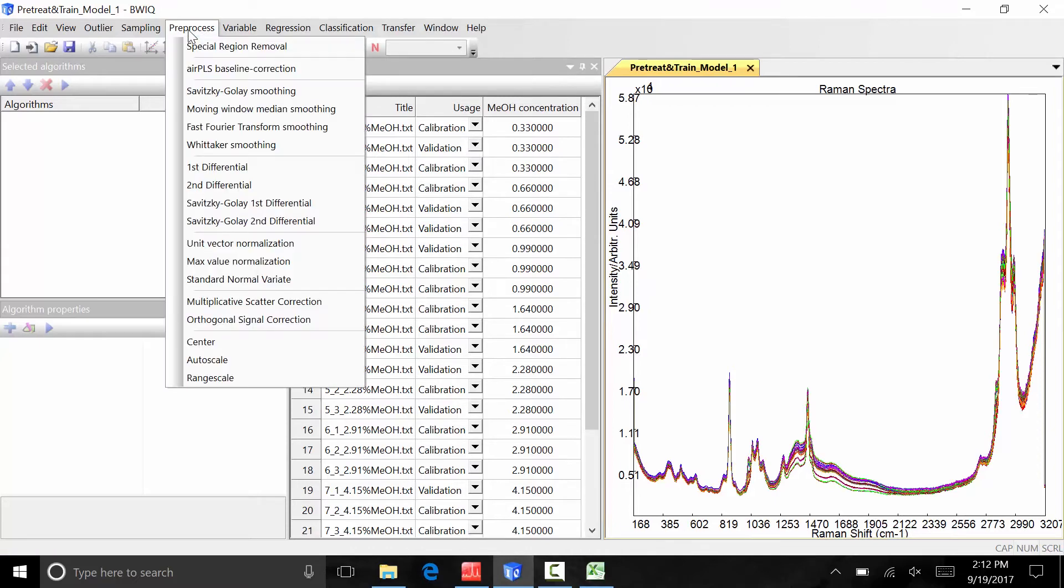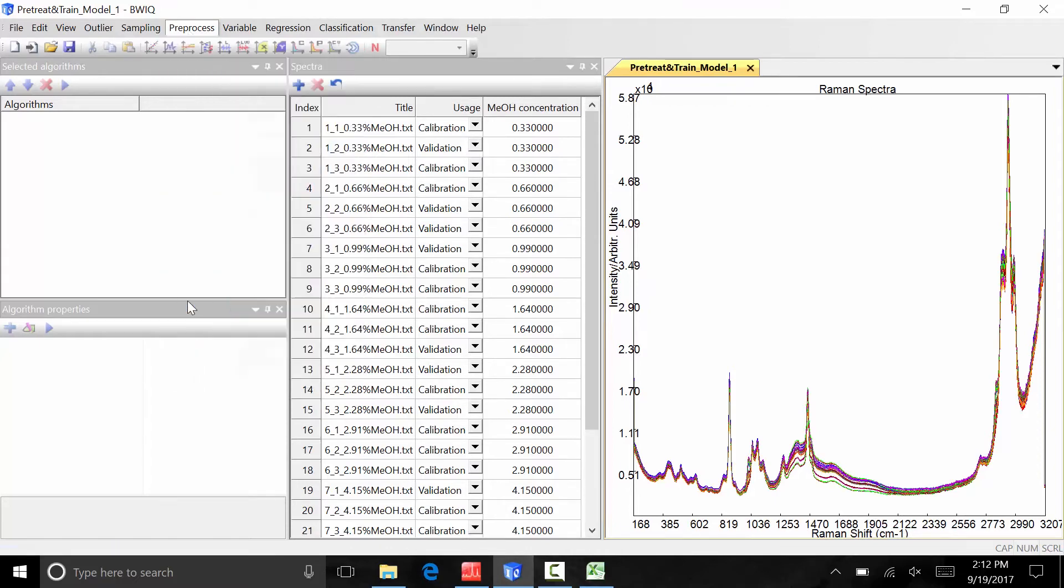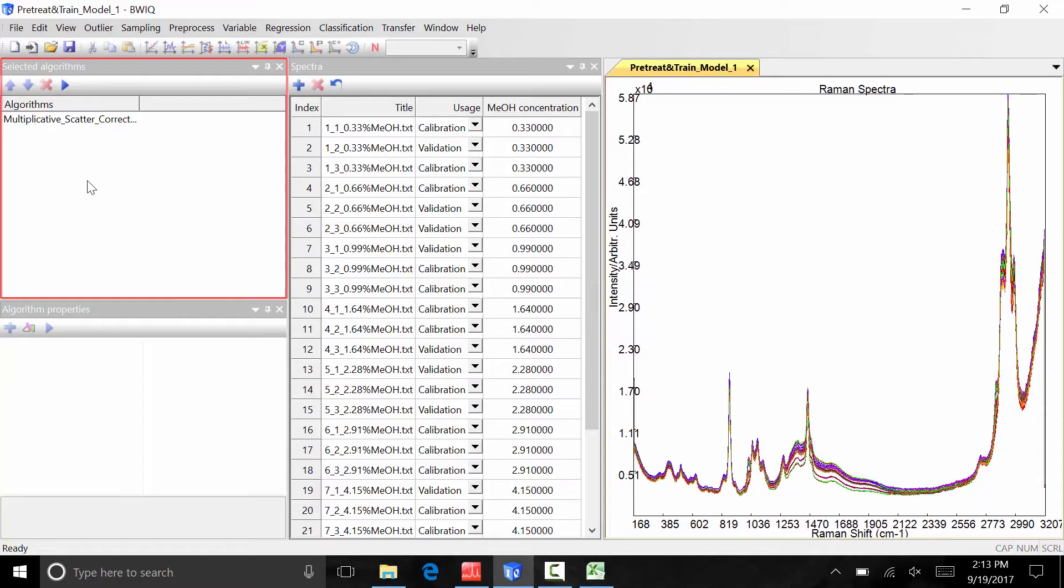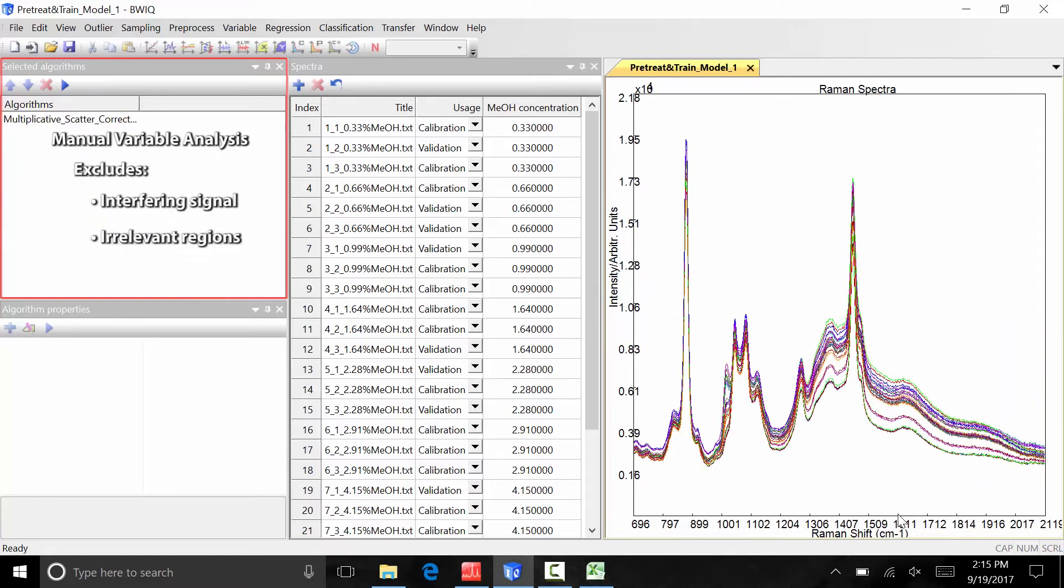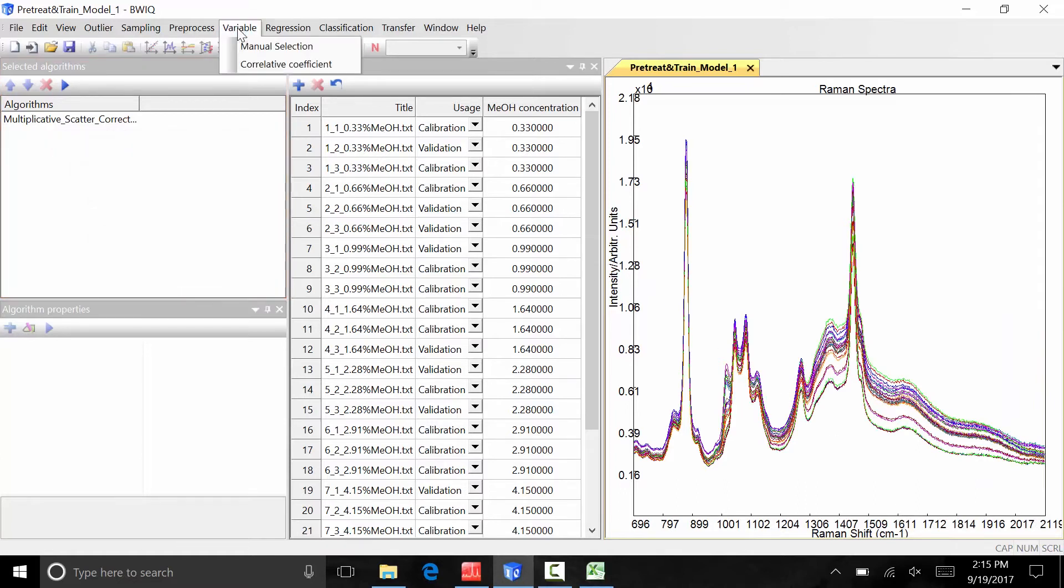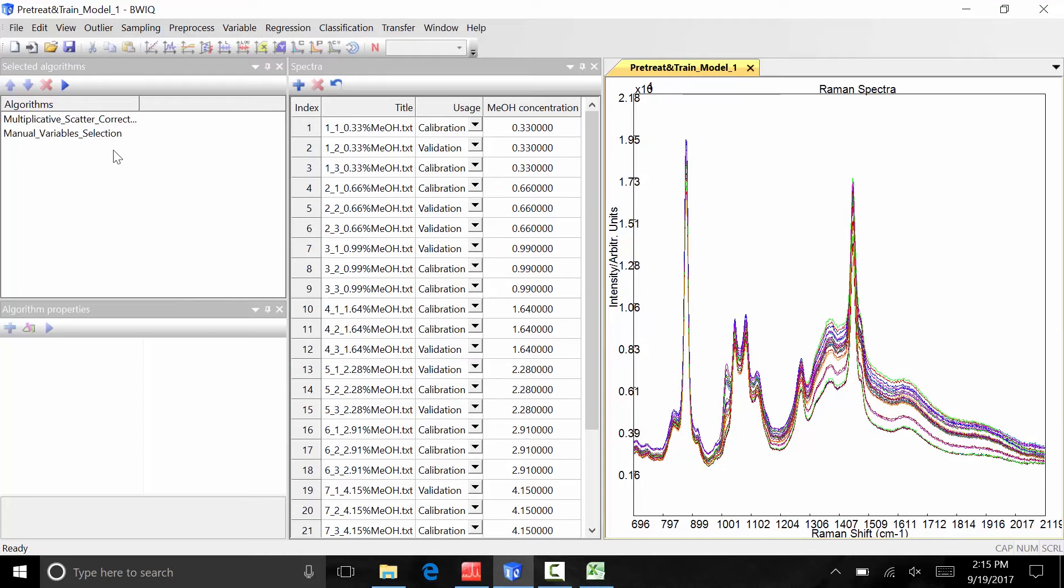Under pre-process, select multiplicative scatter correction. The algorithm is automatically added to the model and now appears in the selected algorithms window. In our data set, the spectral region between 700 and 2000 wavenumbers is where we see the most pronounced variation in the spectra. A manual variable selection can be applied to the data to limit the analysis to defined regions of the spectrum in order to exclude interfering signal or irrelevant spectral regions. Under variable, choose manual selection. A manual variable selection is automatically added to the selected algorithms window.